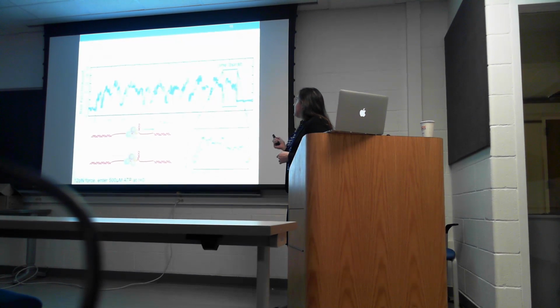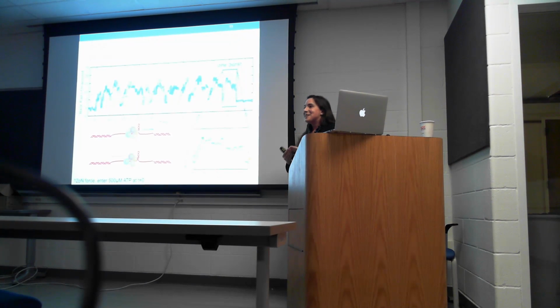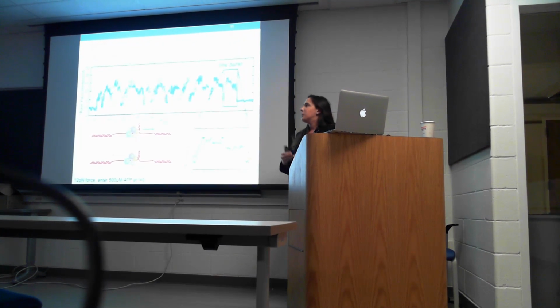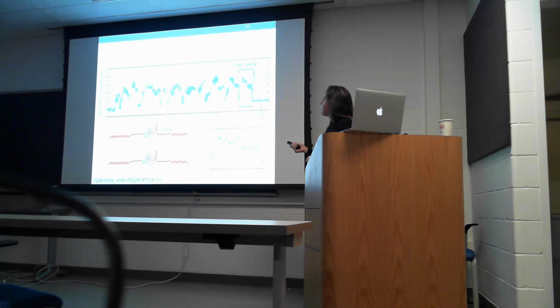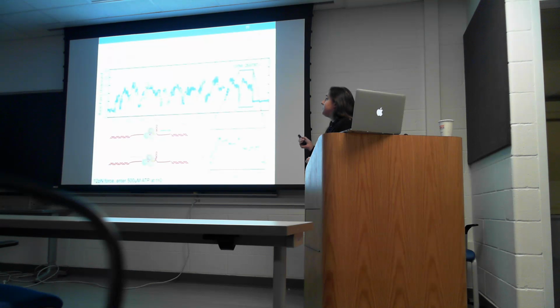And these bursts have limited processivity, which is the number of base pairs XPD unwinds in one attempt. You can see that each of these bursts only unwinds somewhere around 15 base pairs, and it has available 89 base pairs to unwind. So that's not that much.